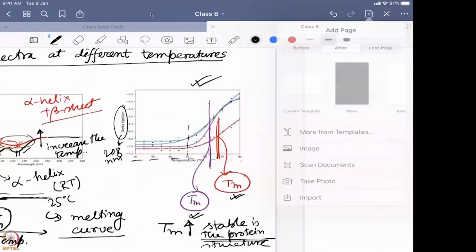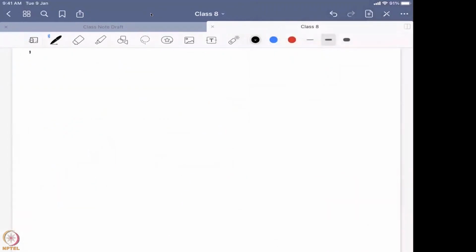How these things are happening. And now, example number 4 is more of an example, but a kind of answer to the quiz question that we had in the last class. The question was, we have an amide bond, and these are the alpha carbons, which are actually chiral.